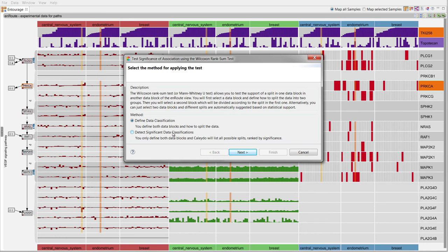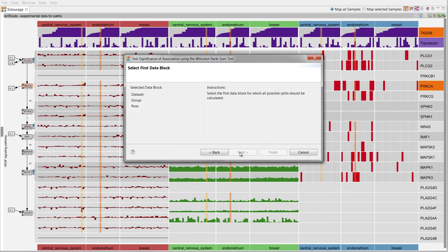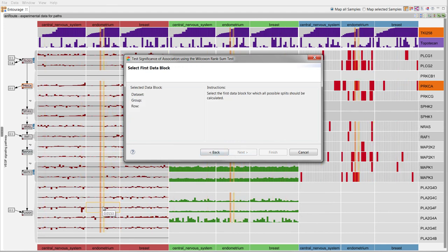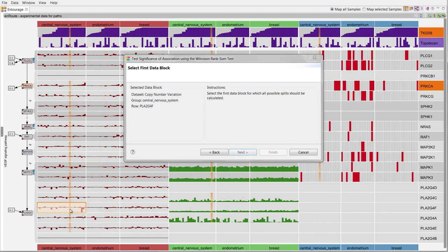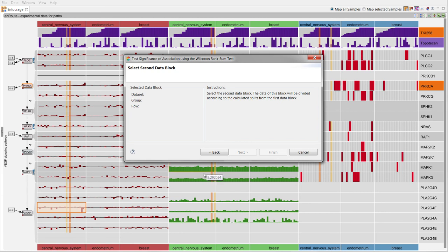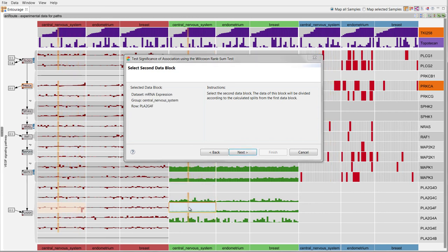For this test, we can also manually define partitions in the data or have Entourage automatically calculate all possible partitions. The partitions are calculated for the first data block and applied to the second one.